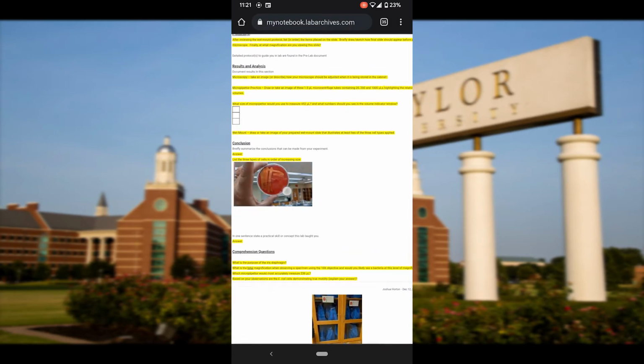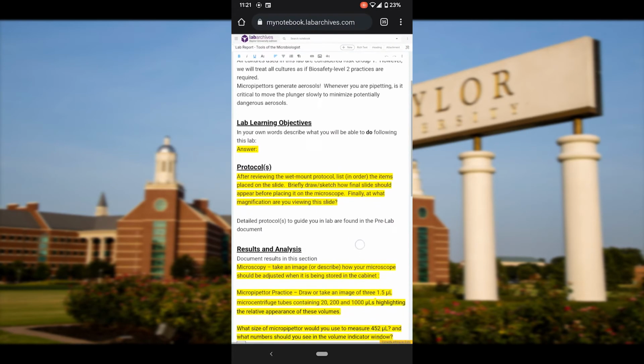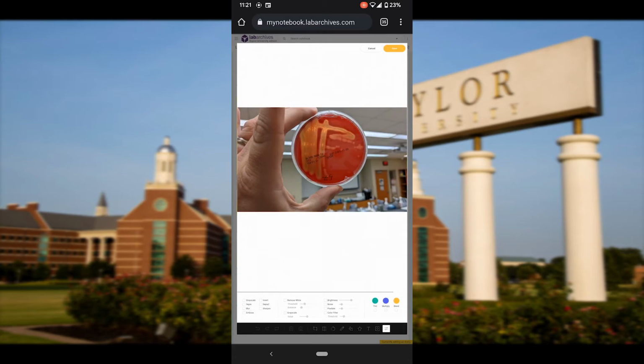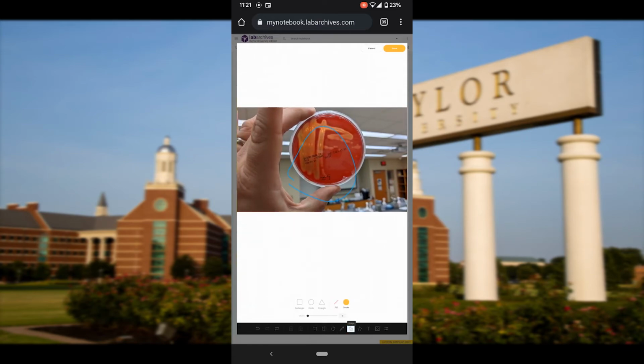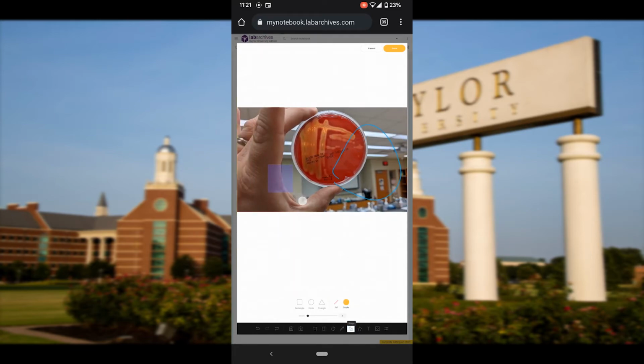But you can, again, unlike before, you can't just double click on it to make it edit. You have to go up and select edit, go down to your image, and then you'll have a significantly more broad set of tools. So you can add things like different types of text. You can move on there. Of course, the drawings with your finger, and it slides around a little bit. It's not as good. Using the shapes works a little bit better. As you can see here, it's much easier to draw the shapes with your finger because it'll just kind of pop up there. You know, it's not the best option, but it is an option if you don't have anything else to do or you don't want to do it on your PC. But I suggest making the edits on your phone that you want and then finishing at home on the PC.